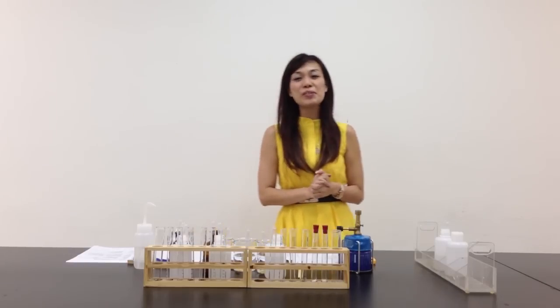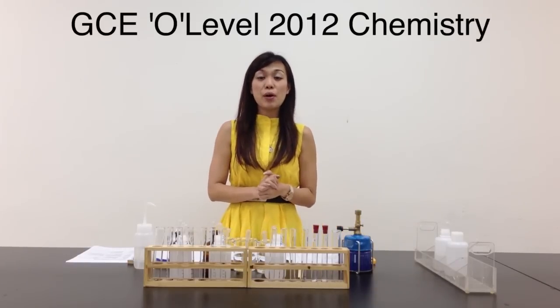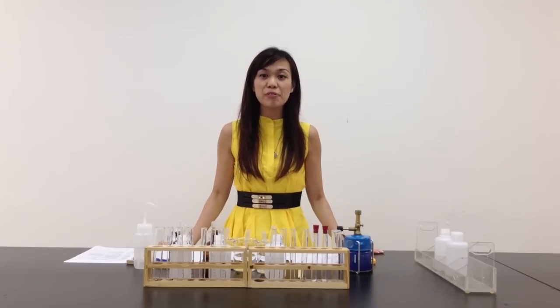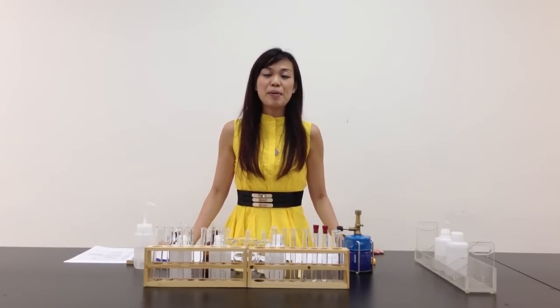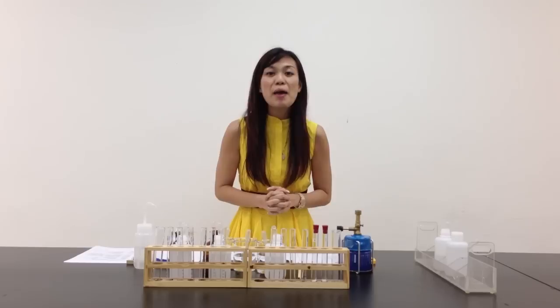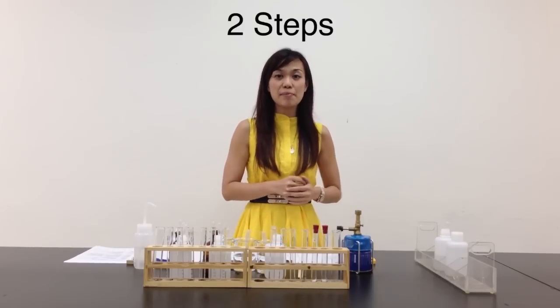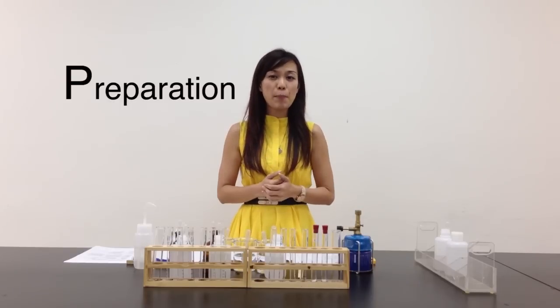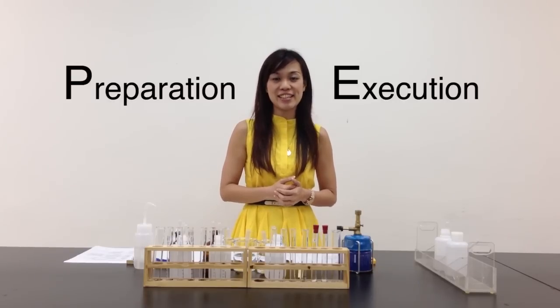Hello! Today we're going to do the 2012 practical exam. As I said before, 2012 is one of the most difficult practical exams for the past 10 years. But do not fret, because there's always the two basic steps that we do before we start any practical. I call it the PE — P stands for preparation and E stands for execution.